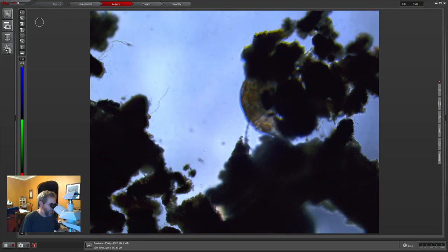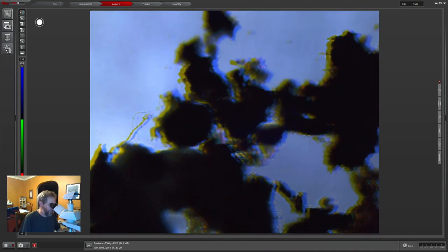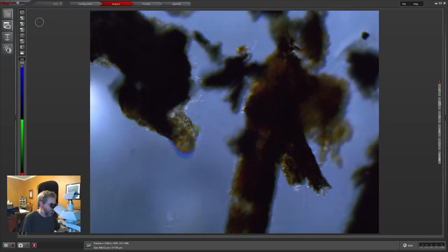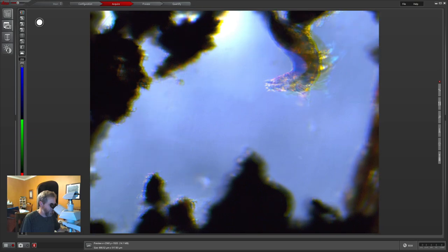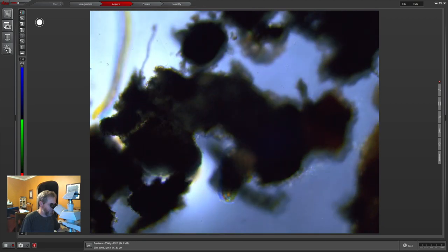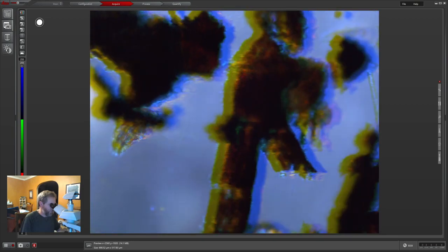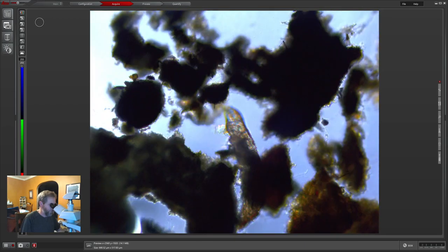There's the water bear itself that we were looking at earlier. The droplet is relatively small but it seems to be holding up so far. I think my plan is to rinse it into a different container and then transfer some of the material over to the same container so that we can keep it separated but also have enough food and natural conditions for the organisms. That way the water bear can kind of stay around, and hopefully if we can keep the eggs around for whatever it is — another 12 or 13 days — they'll grow into more water bears and we can have a little culture of water bears.